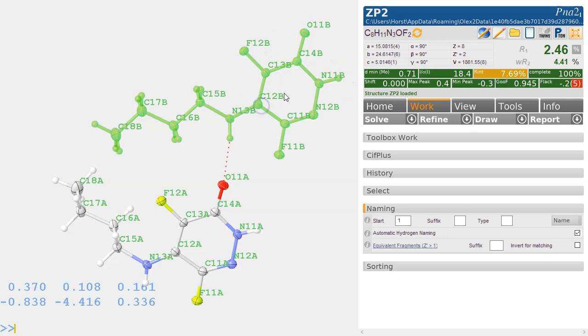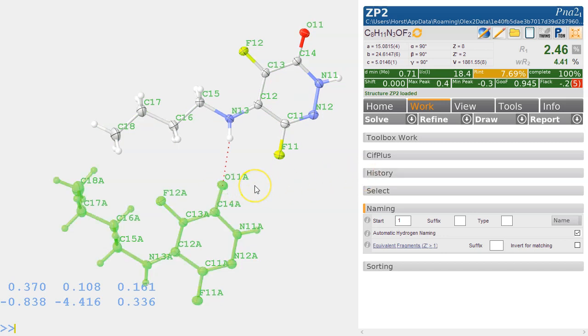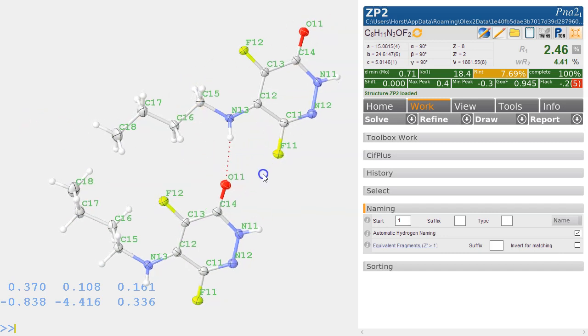If you want to get rid of this again, you double click this, use the up key, and you just don't have a suffix, so that deletes the suffix again. We can do the same here and get rid of the A. Now we've got the same names, which is of course not very good, but maybe we want to go back to the system of having ones and twos.